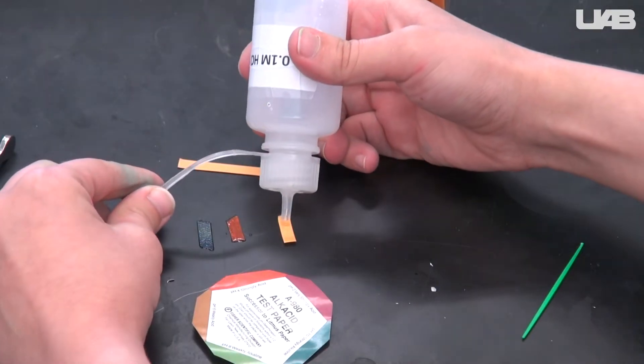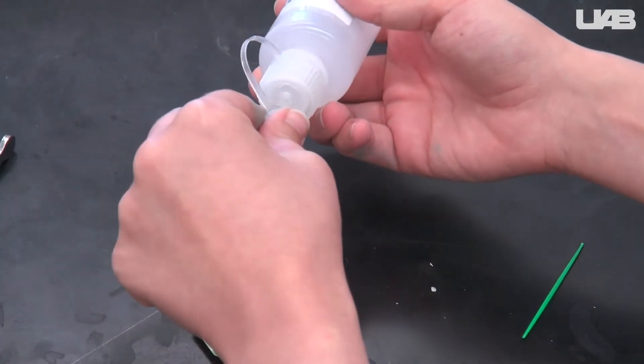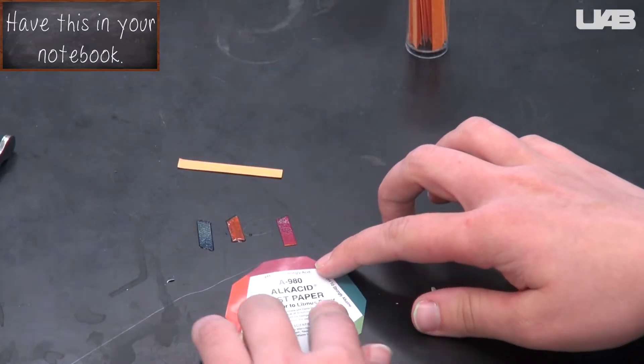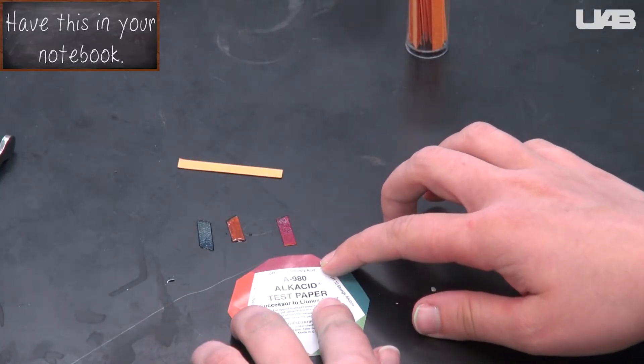To test the pH, you can rip up some pH paper, then place a drop of each of the solutions on it. Compare the color of the paper to the color of the key to estimate the pH.